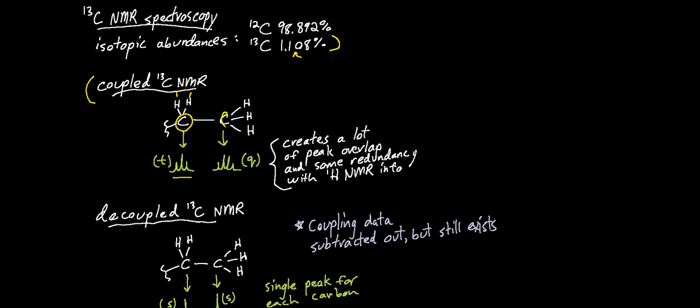This carbon right here, you would see a single signal split 3 additional times into a quartet for that carbon. You would think that this information is useful. Actually, it is very useful, but not in a carbon-13 spectrum because of the amount of peak overlap that is going to get generated in a carbon NMR. The beauty of a carbon NMR is the resolution.